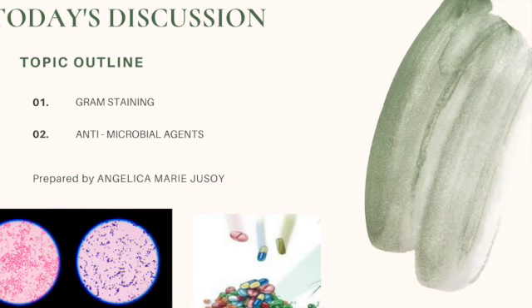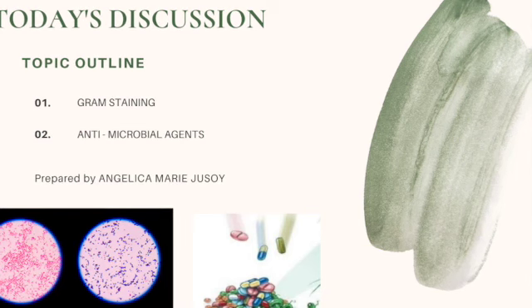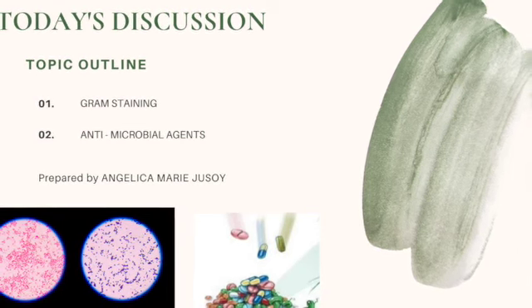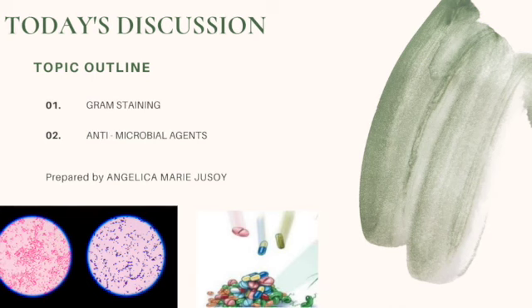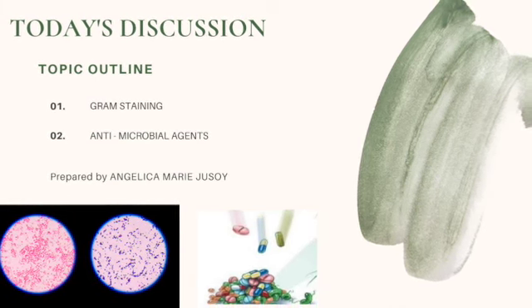So my discussion for today would be about Gram staining and antimicrobial agents. Under Gram staining, I will be talking about what it is, its purpose, what type of stain Gram stain is, its procedures, and how to perform a Gram stain, and its purpose.